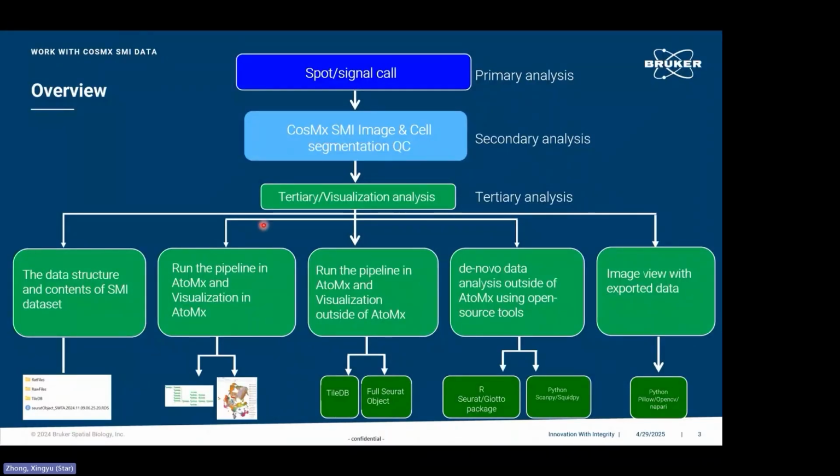You can also analyze the data in AtoMx and do the visualization in AtoMx, which will be covered by my colleague in the AtoMx basic sessions. And also you can run the pipeline in AtoMx and visualize the data or make plots outside of AtoMx. This part we will also cover in this session.